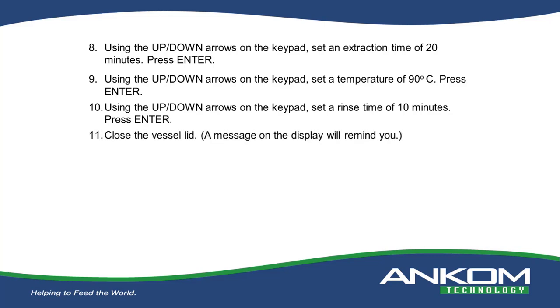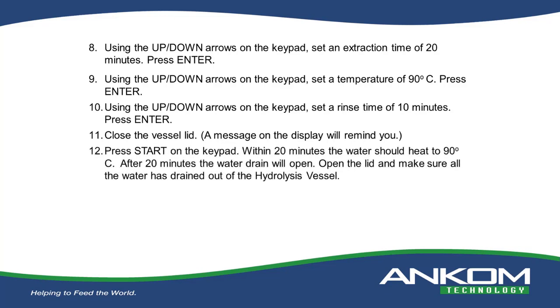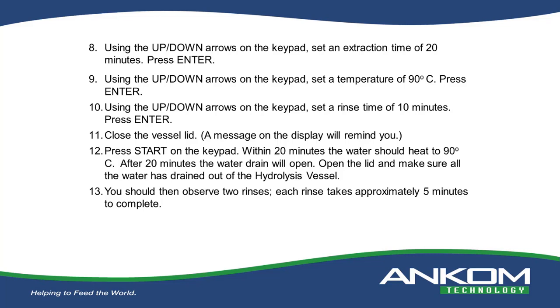Close the vessel lid, and there will be a message on the display that will remind you to do this. Press Start on the keypad. Within 20 minutes, the water should heat to 90 degrees C. After 20 minutes, the water drain will open. Open the lid and make sure all the water has drained out of the hydrolysis vessel. You should then observe 2 rinses, with each rinse taking approximately 5 minutes to complete.